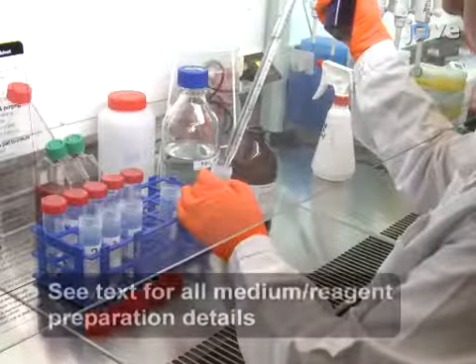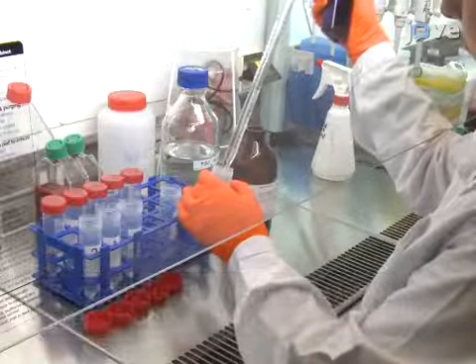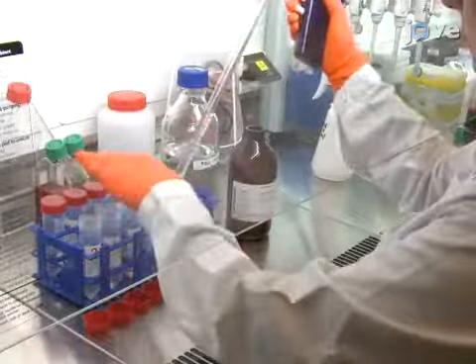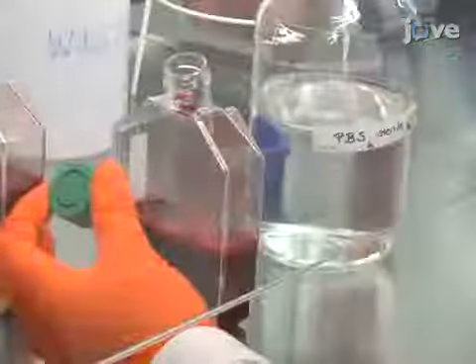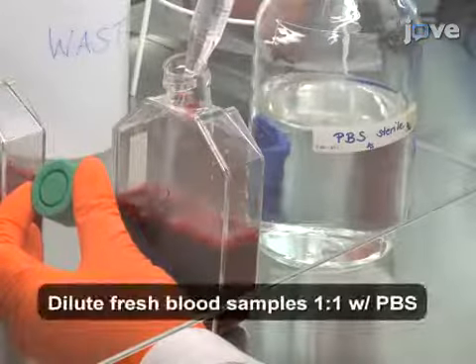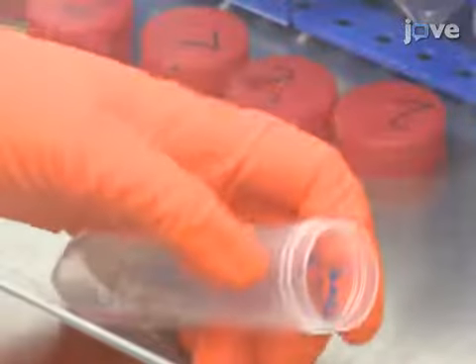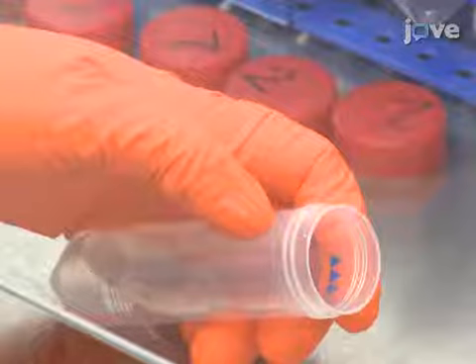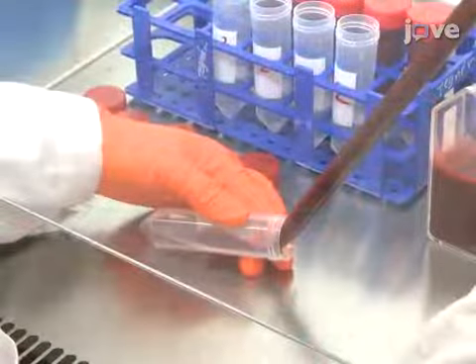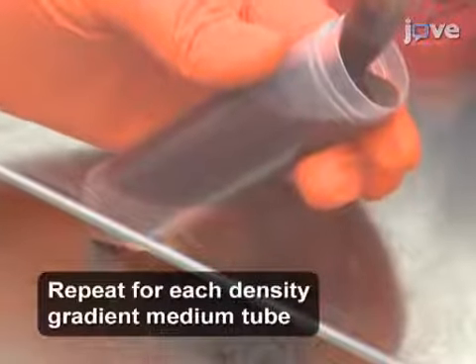To isolate peripheral blood T-cells, begin by adding 15 milliliters of room temperature density gradient medium into five 50 milliliter tubes per buffy coat, and bring the final buffy coat volume up to 180 milliliters with room temperature PBS. Next, tilt a tube of density gradient medium to the side, and slowly layer approximately 35 milliliters of diluted blood onto the density gradient medium without mixing the solutions.